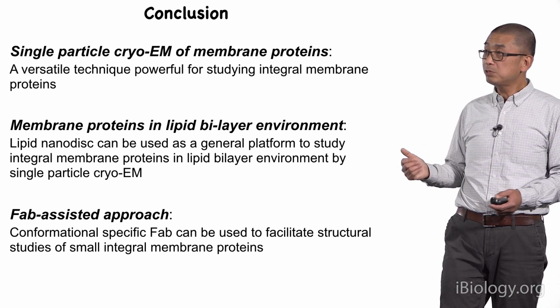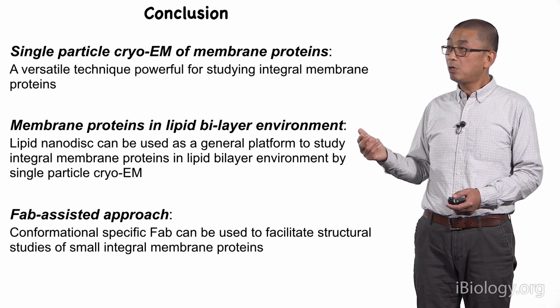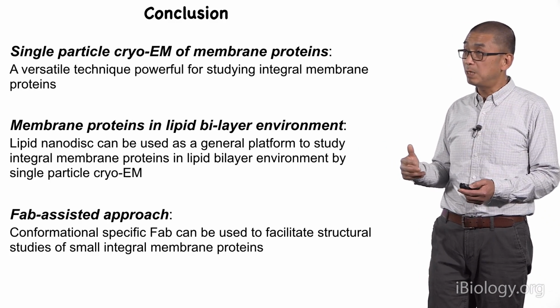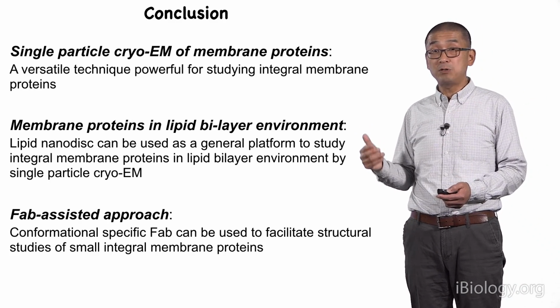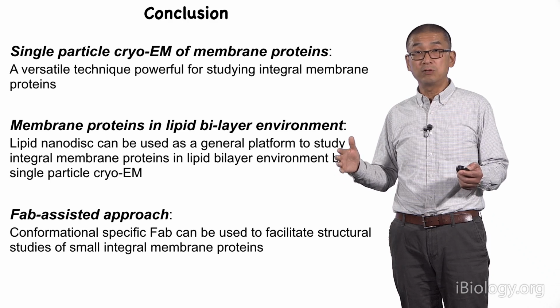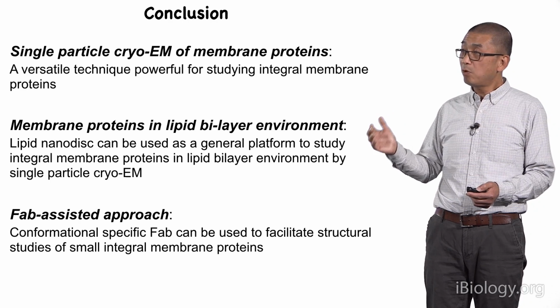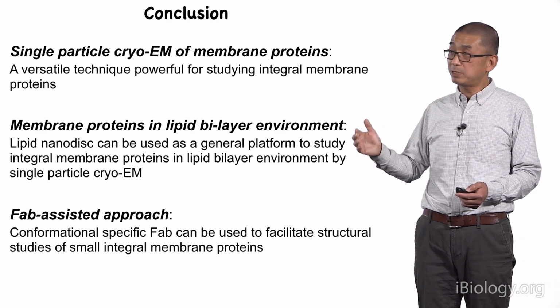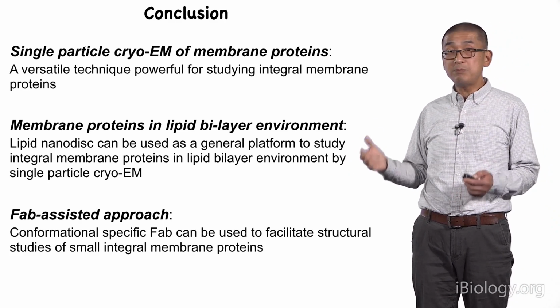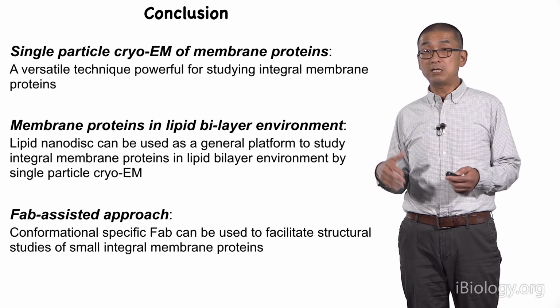Now, to make a conclusion here, we have demonstrated that single particle cryo-EM has become a versatile, very powerful technique for studying membrane proteins, particularly ion channels and a large group of membrane proteins that are difficult to crystallize. For those membrane proteins, nowadays it is probably a more efficient way to obtain a high-resolution structure. We also demonstrated that it is now possible to put a membrane protein into a lipid bilayer environment using the lipid nanodisc approach to get a high-resolution structure.